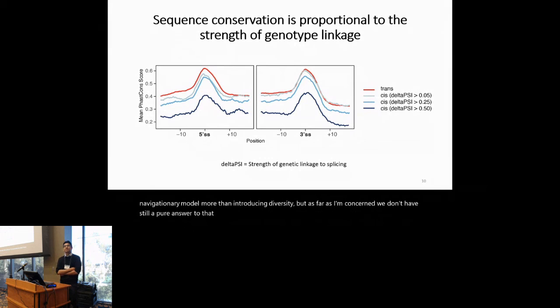And one more quick question: are you able to do that from both nanopore data and PacBio? Yeah, all of the results I've shown here are from PacBio, but we are able to run this pipeline on nanopore as well.